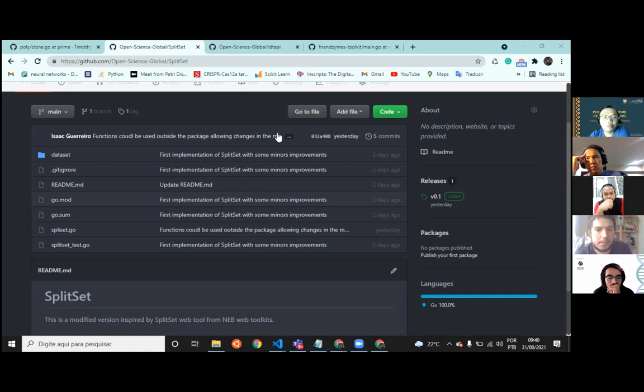I think for now, for the primer design part, most of us are doing trial and error. So the key bottleneck is first looking for the right reference sequences. It's quite tedious to look for reference sequences. Sometimes we cannot see sequences in GenBank. Sometimes you have to go to other databases. Once we have sufficient reference sequences, the next bottleneck is just the alignment. And then depending on the application, the more challenging primers to develop right now are universal primers, specifically for pan genus detection of some viral families, because it's quite difficult to add degeneracies in the primer while ensuring that we are still able to sequence that.